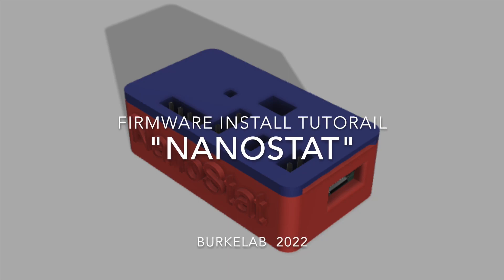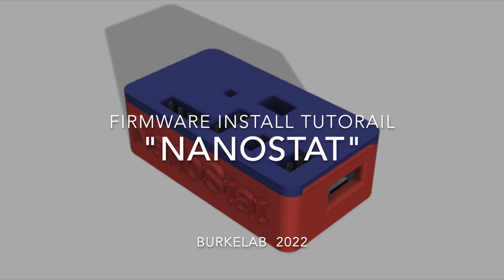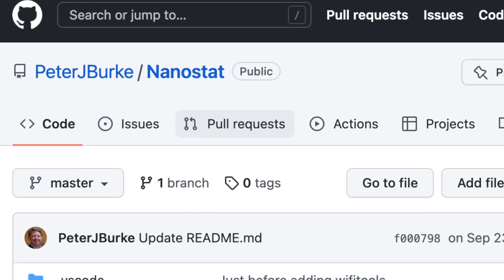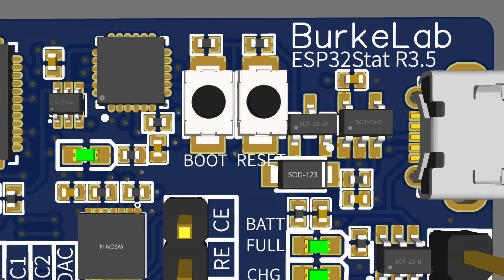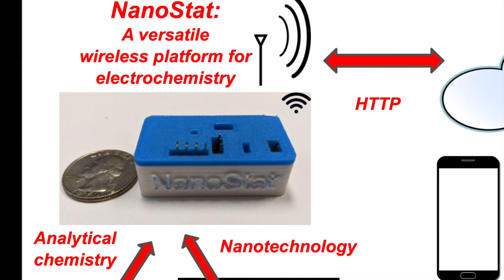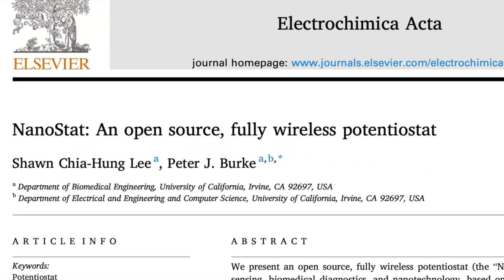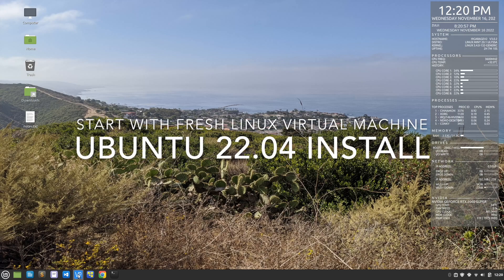Welcome to the Nanostat firmware install tutorial. The goal is to take the code for the Nanostat on GitHub, download it to your computer, and then transfer it to the Nanostat circuit board. Nanostat is a wireless electrochemistry platform for analytical chemistry, sensing, and biology. The description and detail is given in this paper, and there's a separate video tutorial for getting a circuit board made. So let's get into it for the firmware.